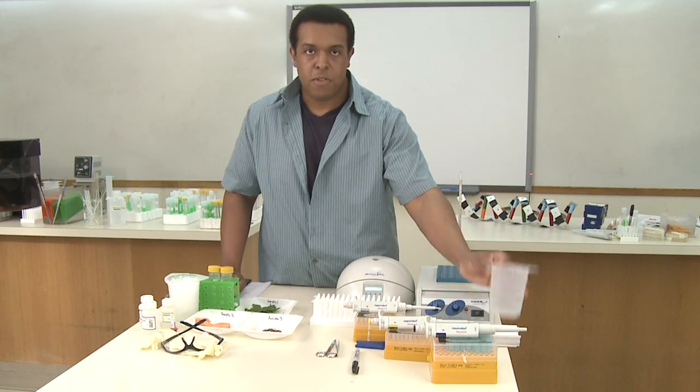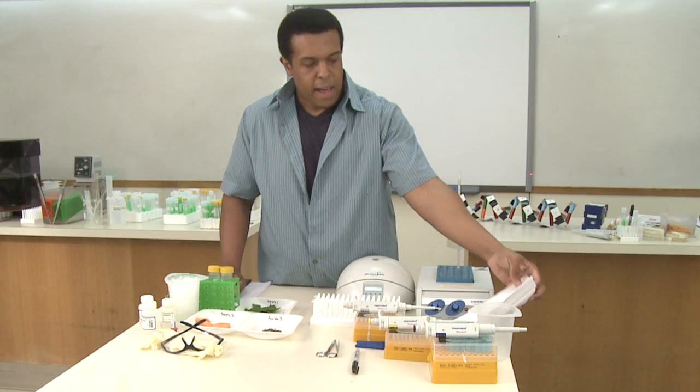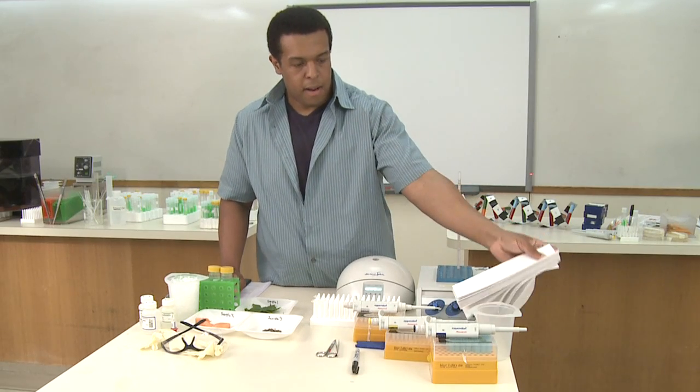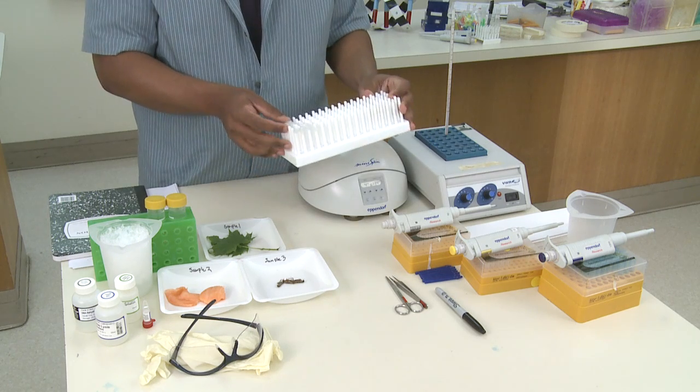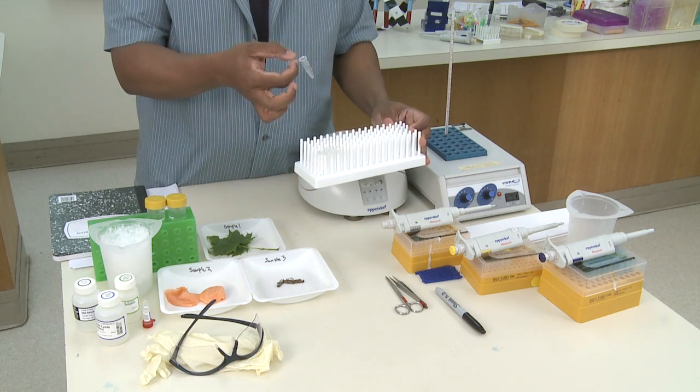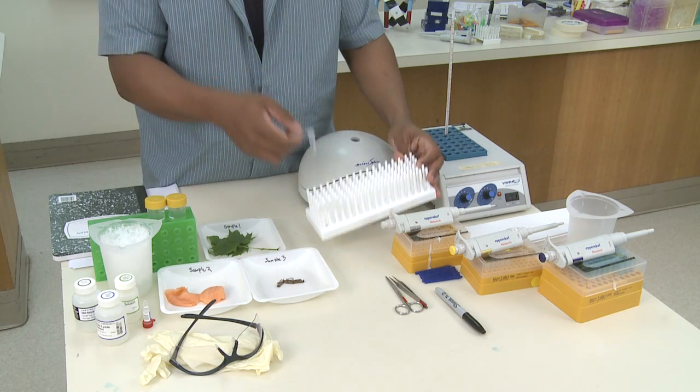For the pipettes, of course, you'll need a waste beaker for the excess tips, and it's helpful to have some napkins lying around for our DNA isolation step. You're going to need a tube rack along with some 1.5 ml microfuge tubes. You need two tubes for each sample that you're going to be preparing.